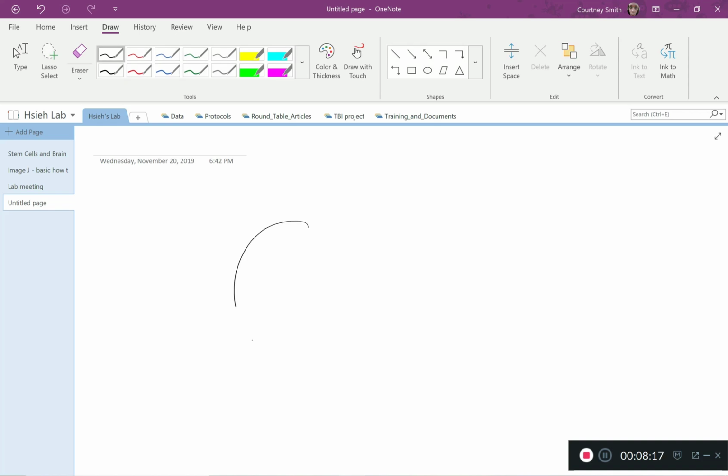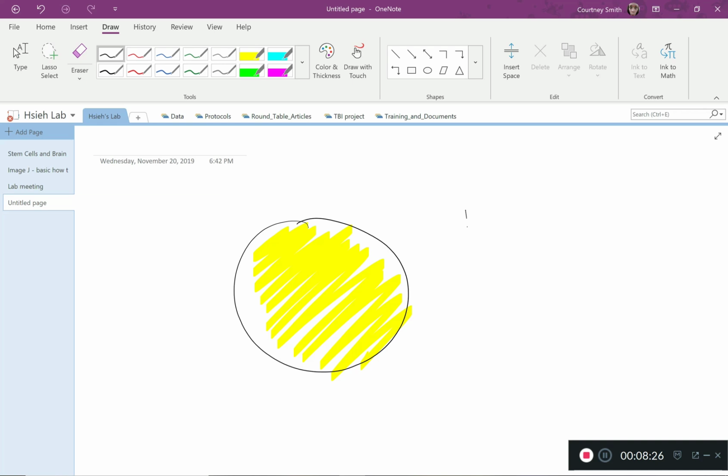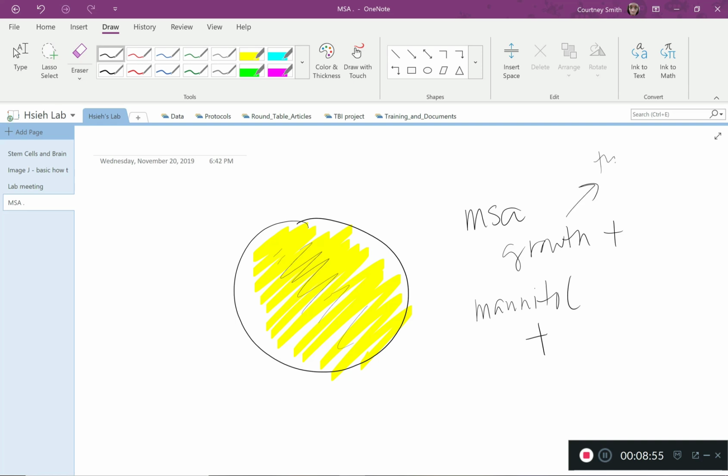Let's say this is a picture, and in the picture the plate was yellow, and it was originally an MSA plate. And you can clearly see some growth on there, like we have some colonies. If I were to show you an image of that, I would want you to tell me that it is mannitol positive and growth positive. If it's growth positive, then that means this bacteria can be classified as a halophile.